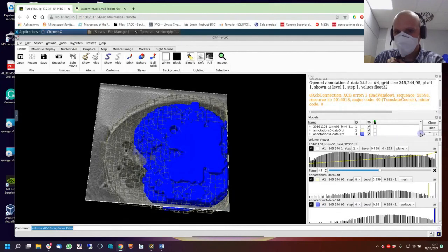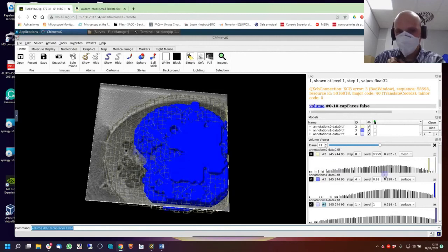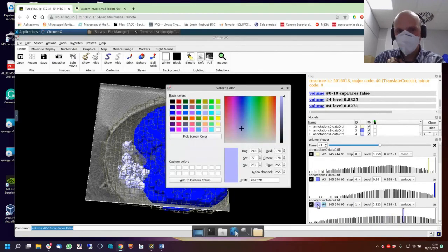So it's here. He's also here. So 4. Okay, also we can go again and smooth it. And here we are. What are those? See, we are more or less with the mitochondria. Go for red. Okay.